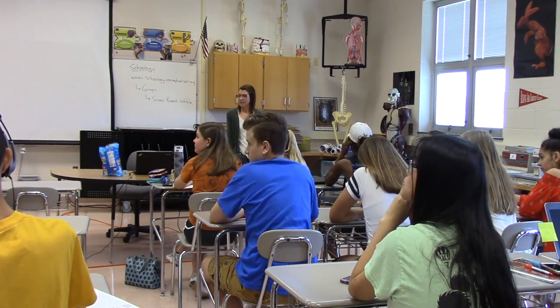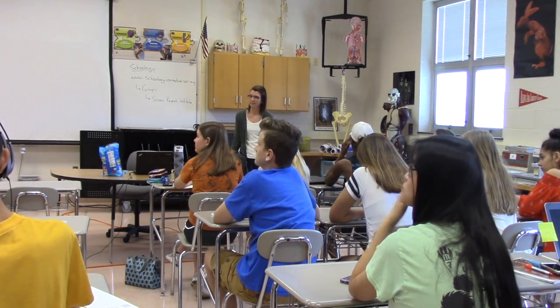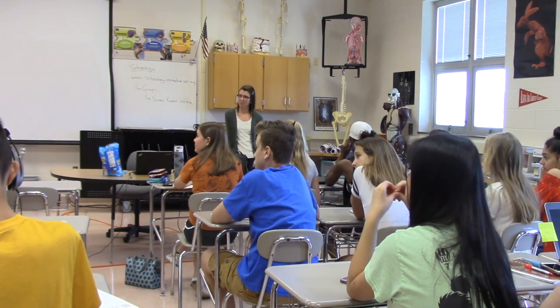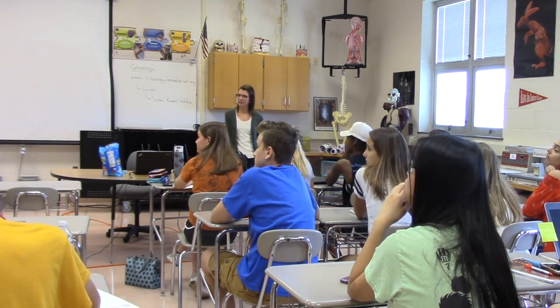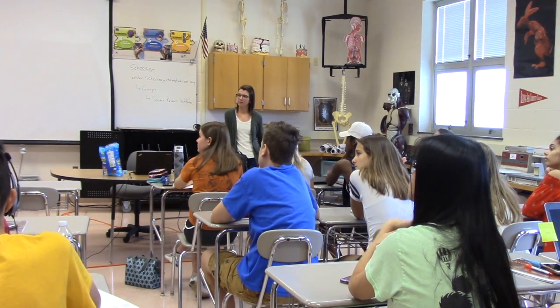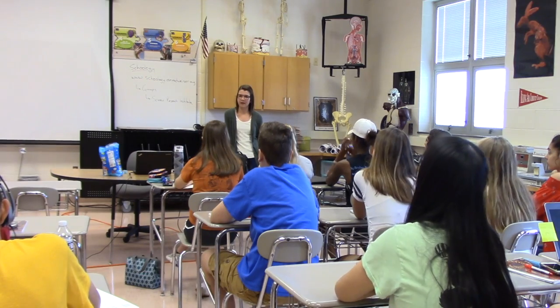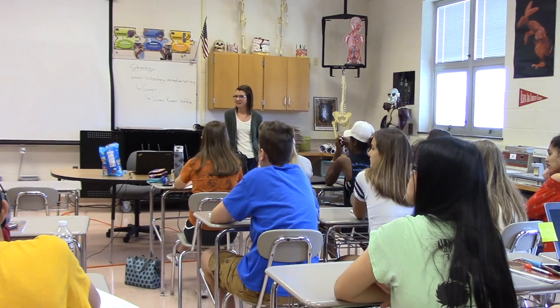Yesterday we talked about data work. We have real-time PCR. I didn't really talk about that with them, but kind of how we can use DNA sequences. What are you guys using for your real-time PCR, instrument-wise? It's called Chai PCR. It's a real thing. Interesting. I can show it to you. Yeah, absolutely. We use a 7500. Ours is much cheaper.